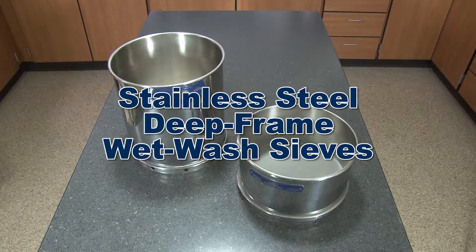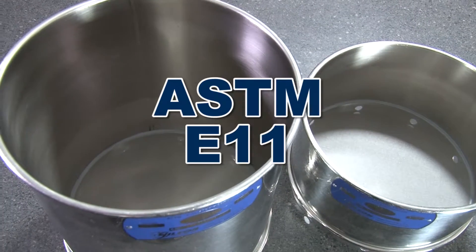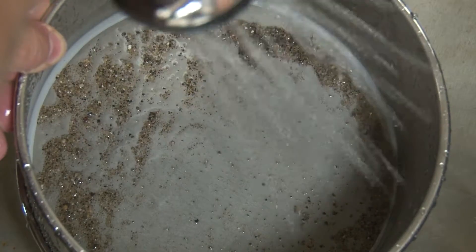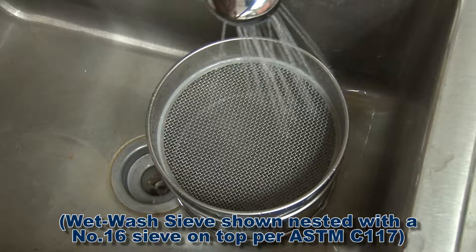Gilson's stainless steel deep-frame wet wash sieves are ASTM E11 compliance grade test sieves, used for fines content determinations, to wash away excessive fines when preparing specimens, or when handling fragile specimens.